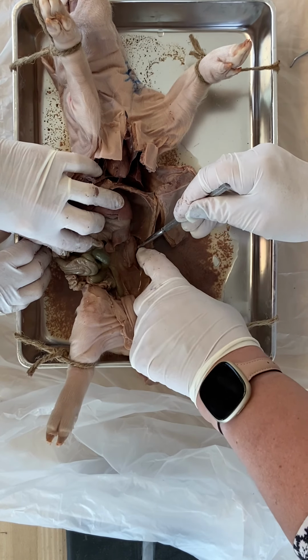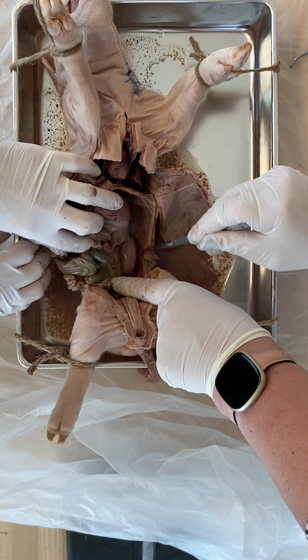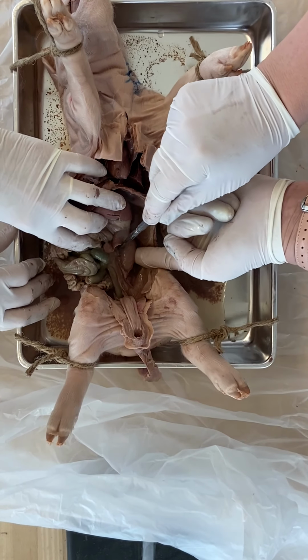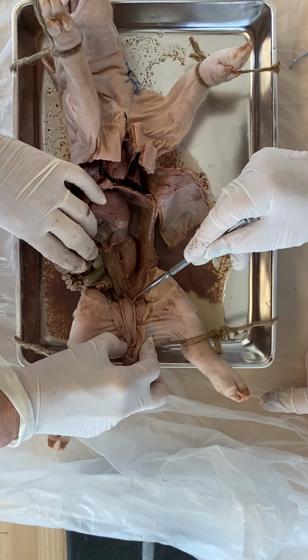There's the other kidney on the other side. There we go. There it is. And the membrane's over everything, of course. And there's the other kidney. So then those kidneys feed then. Oh, these are two ureters coming down the side.